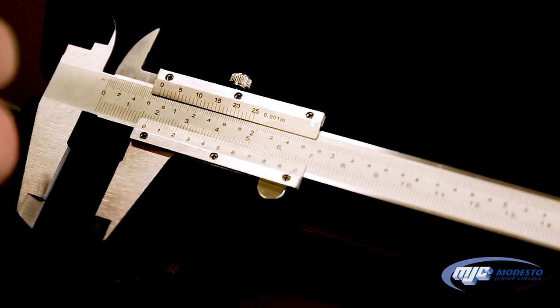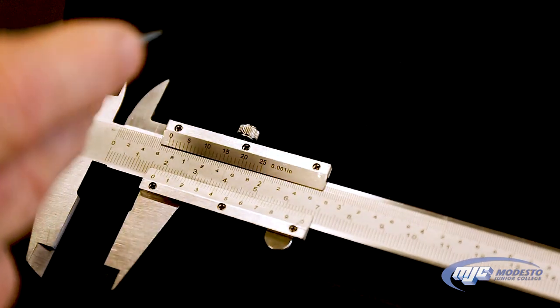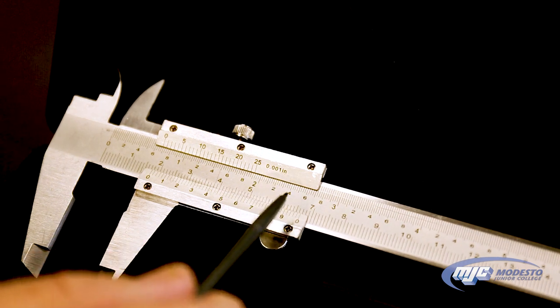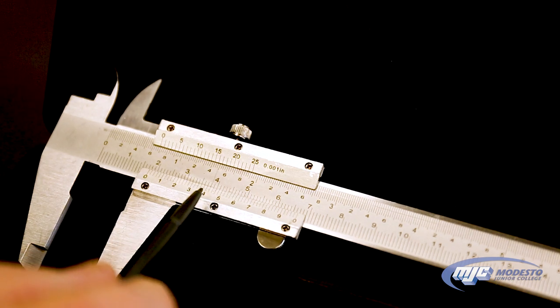Once we've locked the jaws and taken out what we're measuring, the first thing to know is that there's two scales on these calipers. The top scale is in inches, the bottom is in centimeters. We will always use the bottom scale in centimeters.